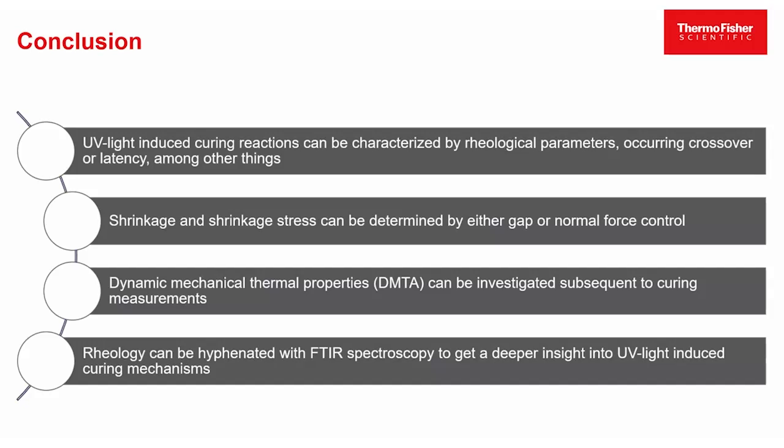But also, if one likes to get an even deeper understanding about the mechanisms of the curing, also hyphenated methods like combining rheology and FTIR spectroscopy can be used to get a deeper understanding of the sample. With that, I'm at the end of my presentation.